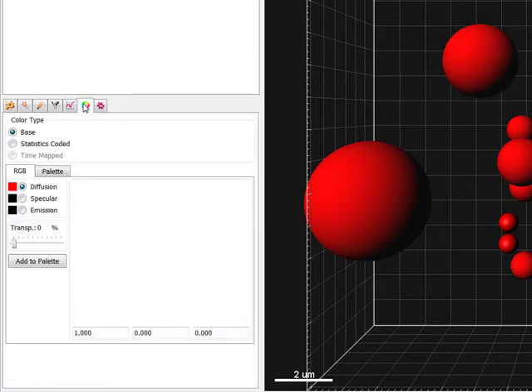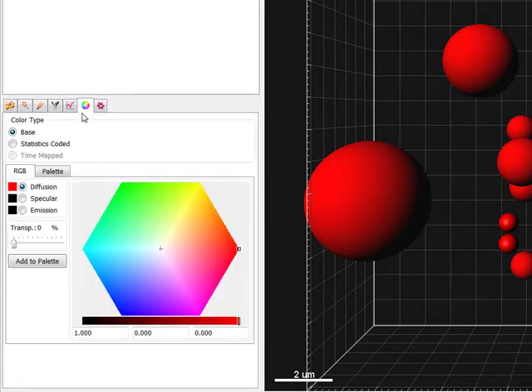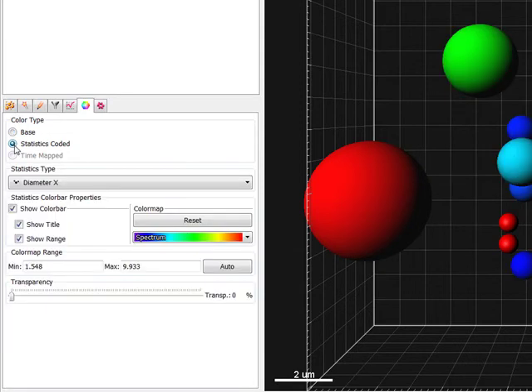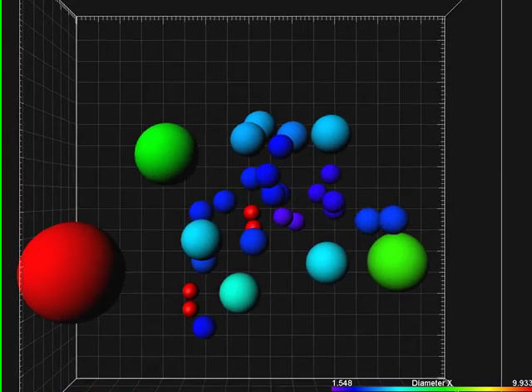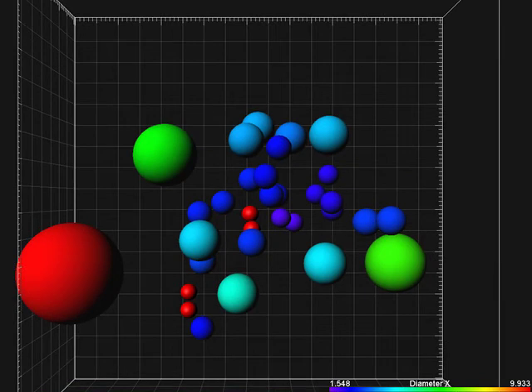To further enhance the visualization, you can color-code the spots based on diameter. And now the image shows the same value, represented both in color and size.